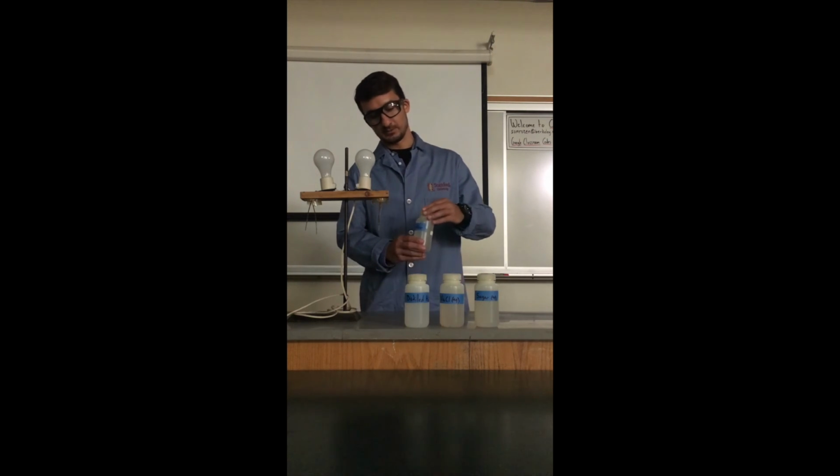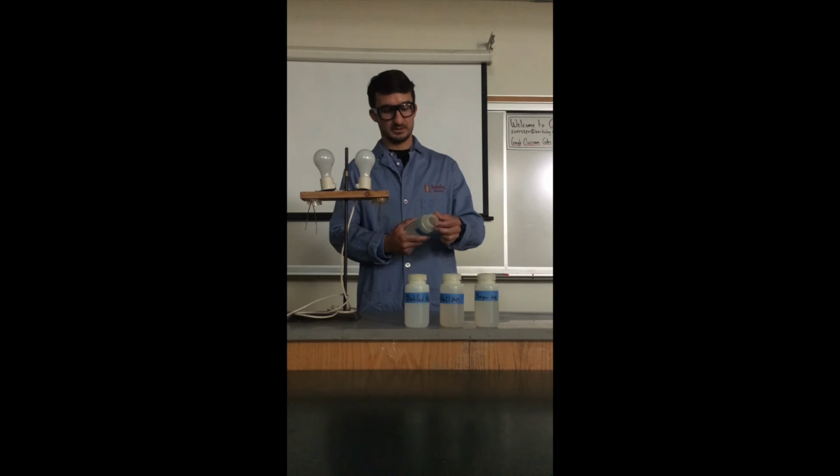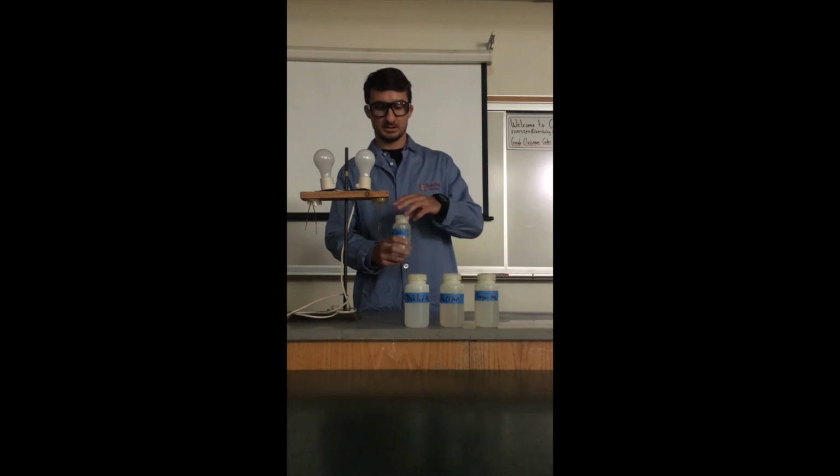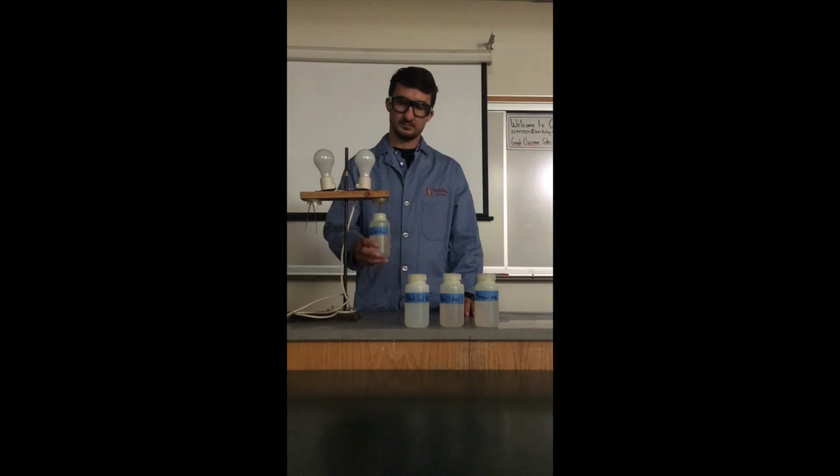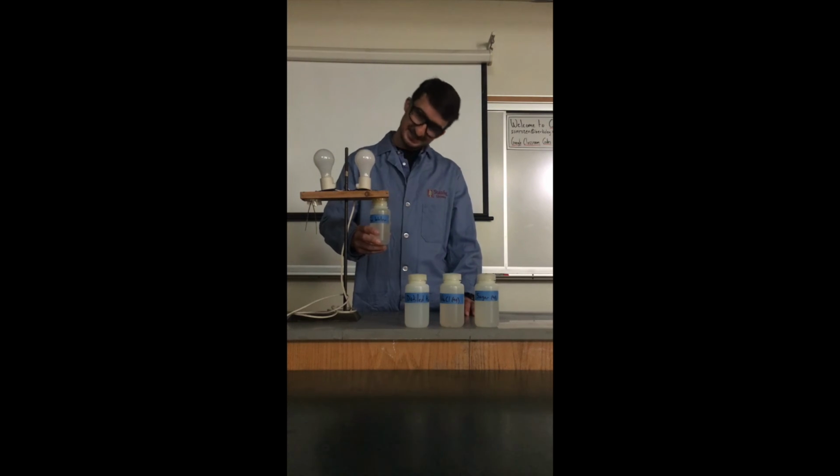So here we go. Here's our tap water solution. Let's see if it conducts. Make sure you have a prediction for it. 1, 2, 3. Anything? Oh, you see a little glow there? Little bit of a glow.